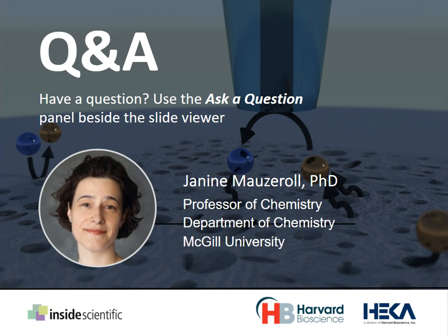So when people want to detect a particular ion like magnesium or aluminum 3 plus, they'll make an ion selective electrode, and that electrode is sensitive to the activity of the ion in solution. And so there are reports on this.